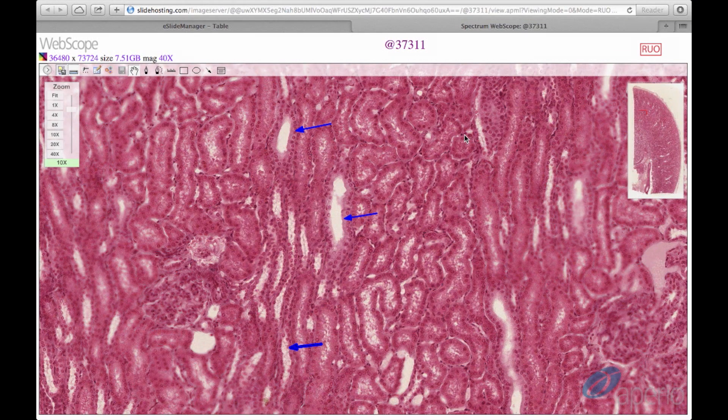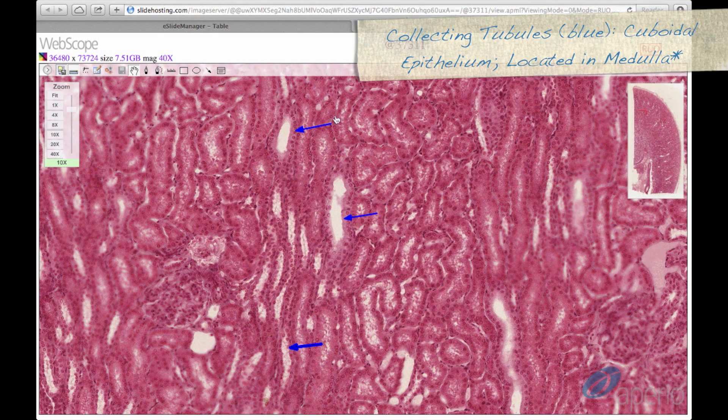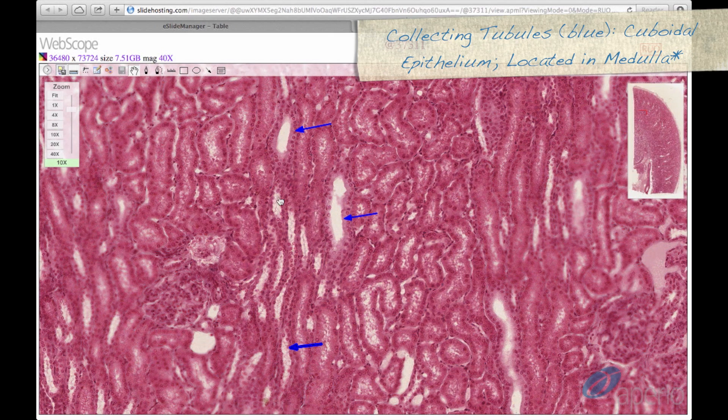Moving into the medullary ray, we can see the collecting tubules of the nephron here at the blue arrows. These have a cuboidal epithelium and are very similar to distal convoluted tubules in appearance. Location is what will allow you to differentiate between the two.